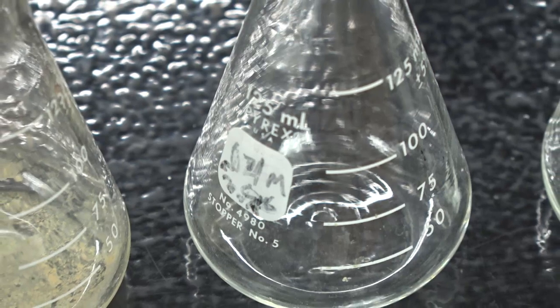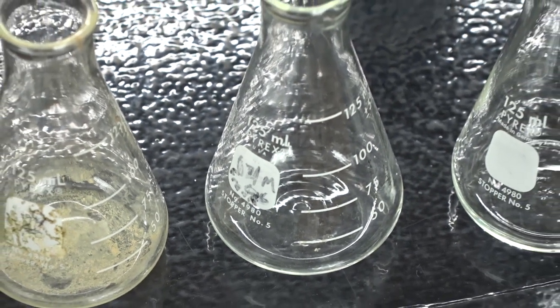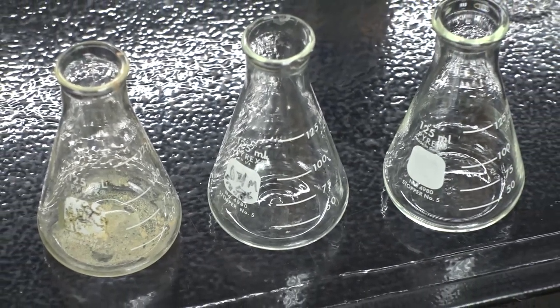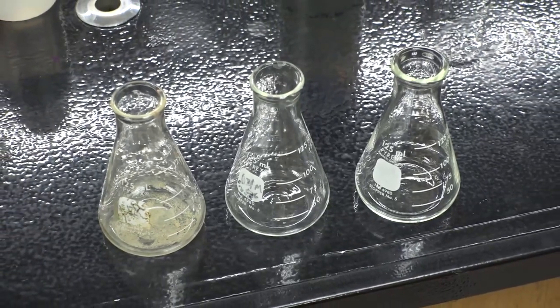In front of me, I have three pieces of glassware. At first glance, they may all look okay to use in your lab, but after a closer inspection, you quickly see why some pieces would be preferred to use over others. While one was cleaned properly, the other two were not cleaned properly.